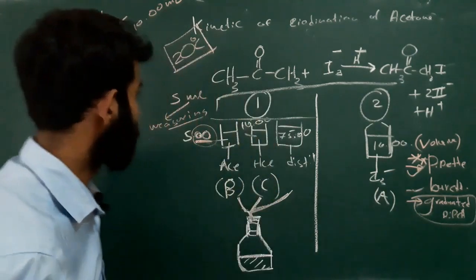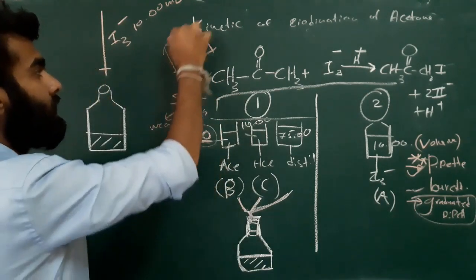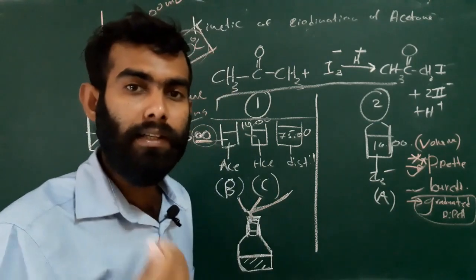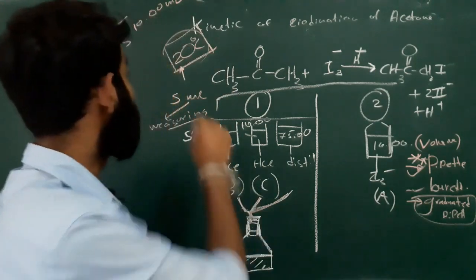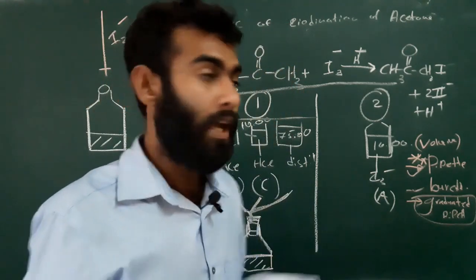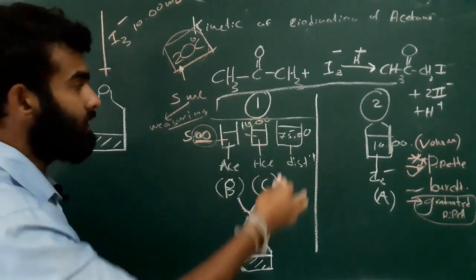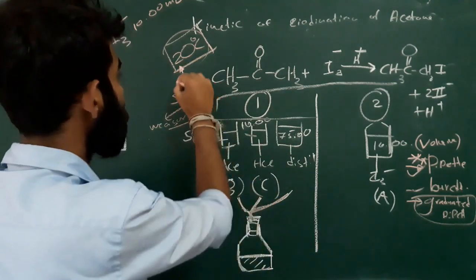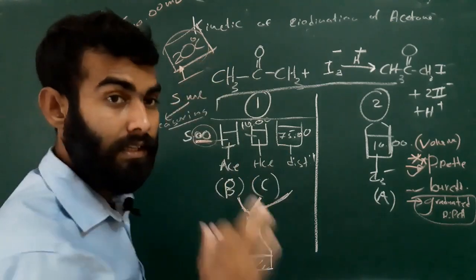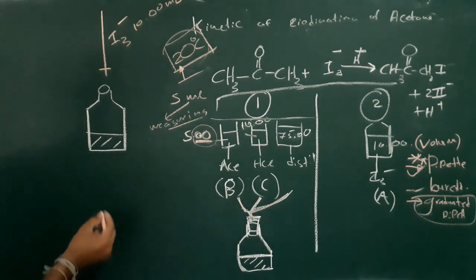That's the first thing. And here, if they mention 20 degrees Celsius or lower, we know the room temperature may be 27, 28, 30, it will vary. However, here they mention we have to keep our reaction at 20 Celsius. So if they mention this temperature, we have to maintain it. How?